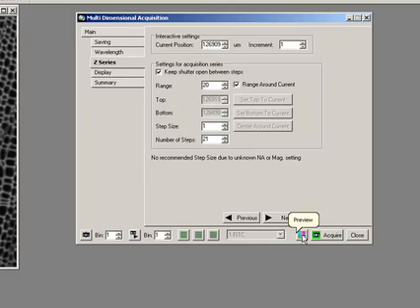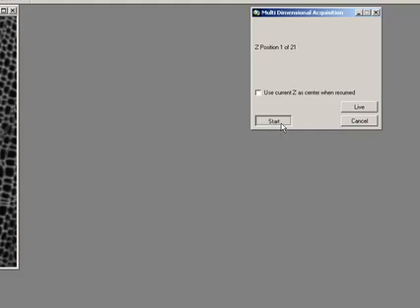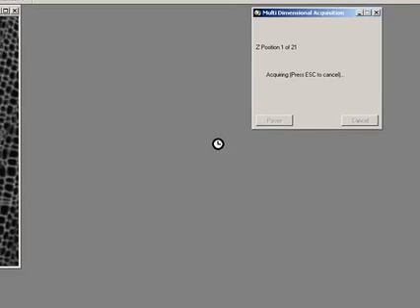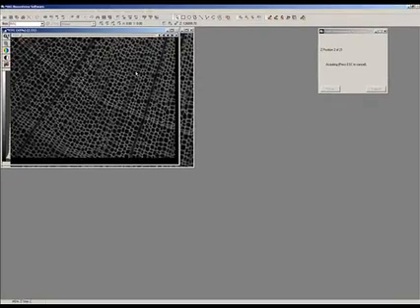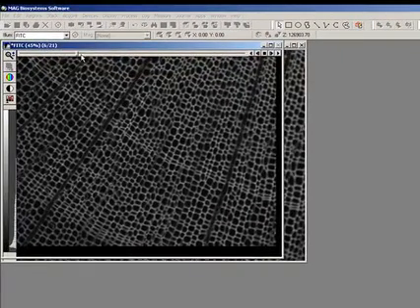So I'm just going to do that and again we can do a preview. Preview is a pretty good way. It can say use Z current as center when resumed, so if we want to go back and do another one, we'll use this as our current Z. We can go back to live, we can make adjustments or we can just press start.